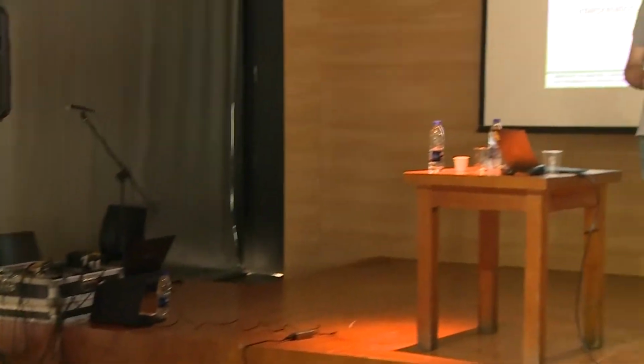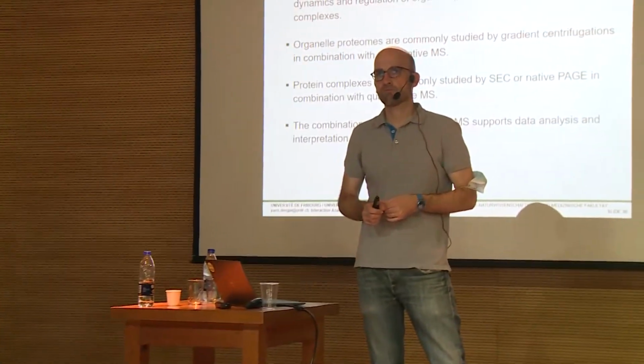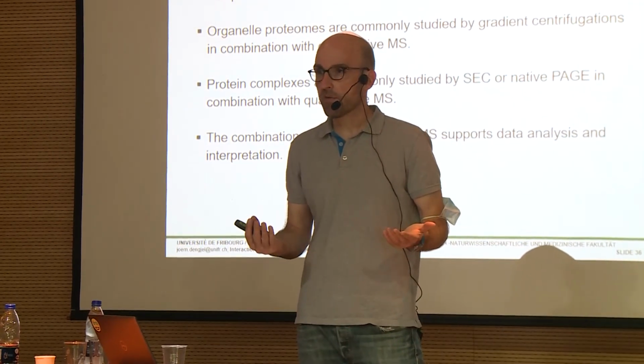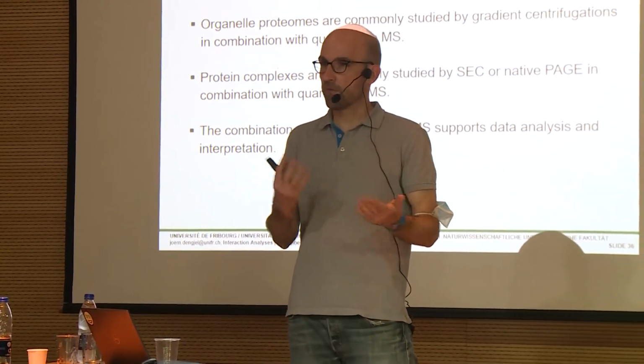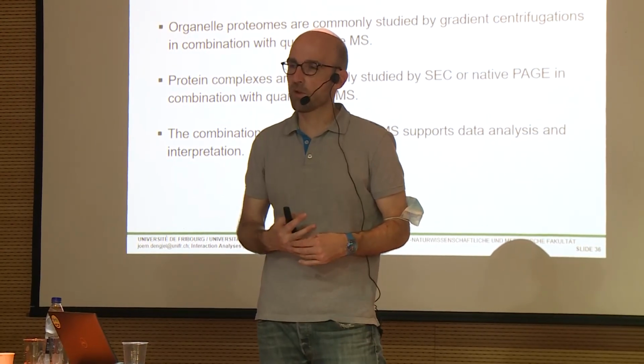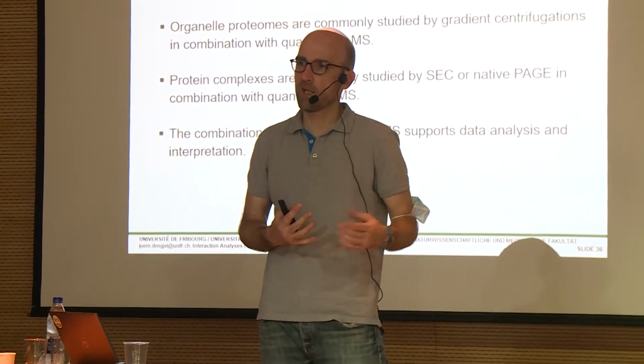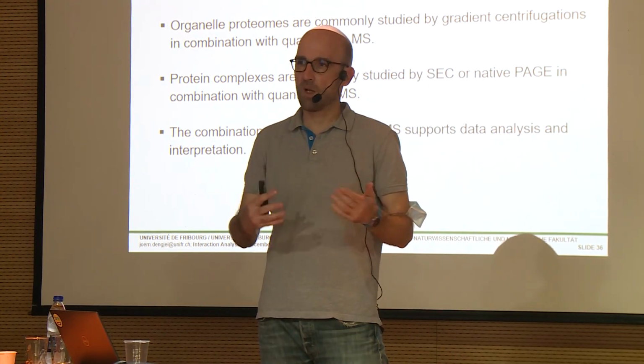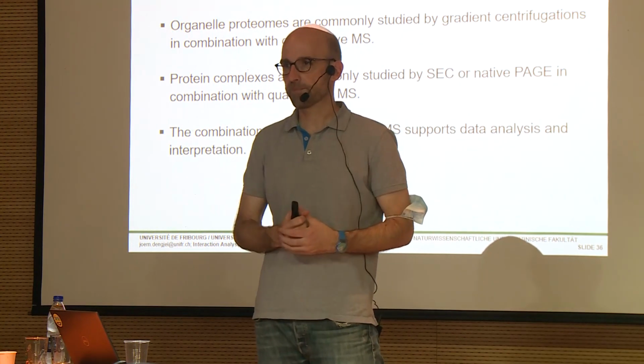If you want to use the affinity purification, it has to be surface accessible, right? Otherwise, this would not function. If you don't want to use mass spectrometry, you could use imaging, right? And then basically look for co-localization by confocal microscopy, that would be a non-mass spec-based approach. But if you want to enrich, it has to be membrane. You have to be able to do an IP.